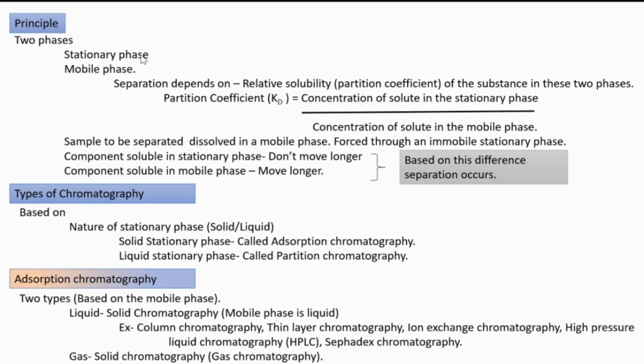The main two aspects that we need to understand: the chromatographic process works mainly based on the nature of two phases.